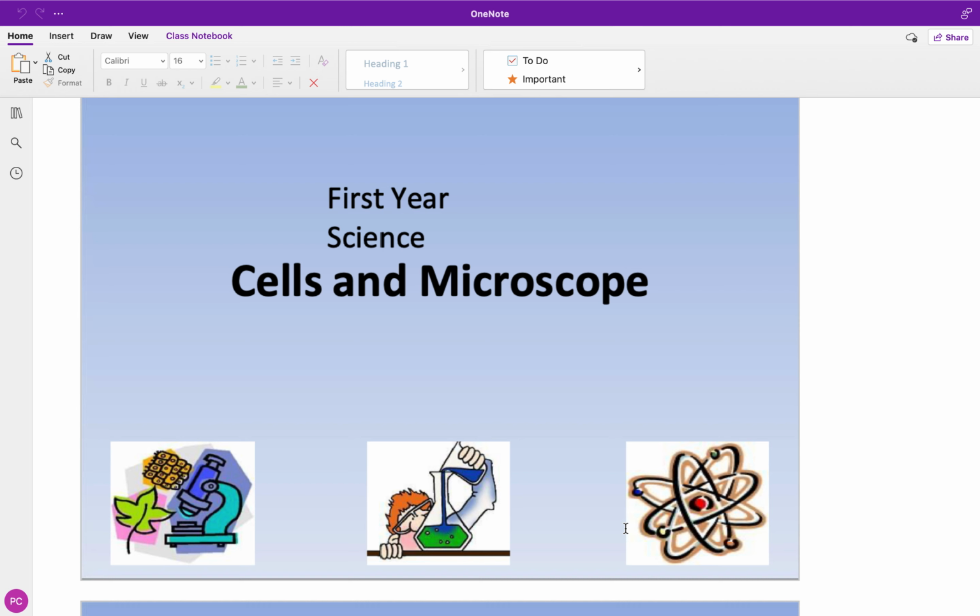But the idea of a microscope, basically for scientists, for people like us, is to see stuff that's small, usually things like blood samples and urine samples and even smaller things, the things that make humans and make animals and make plants, and I suppose mainly things like the cells.